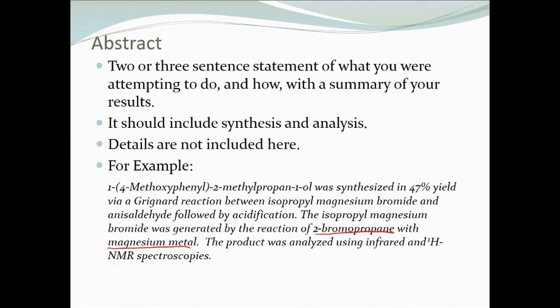And then, of course, we're always giving results. So you would also state the yield that you obtained it in and how you did that analysis. In this case, infrared spectroscopy and proton NMR spectroscopy. In your case, you would also be using boiling point and gas chromatography.